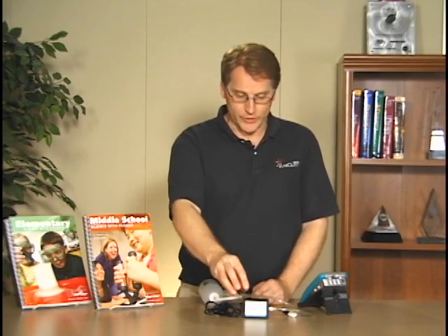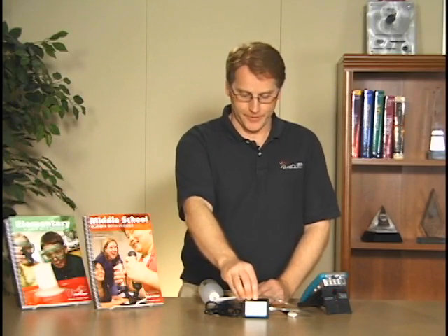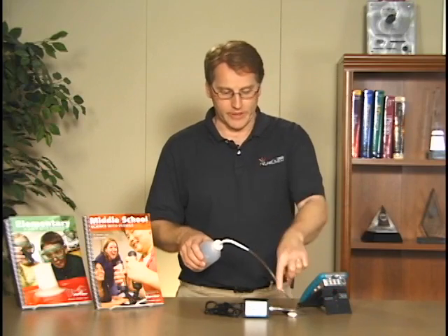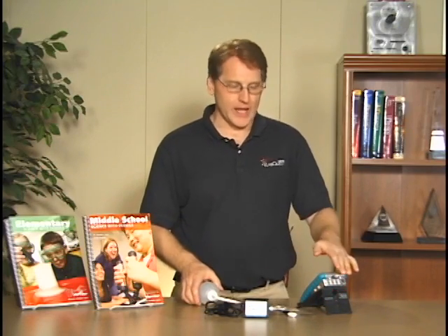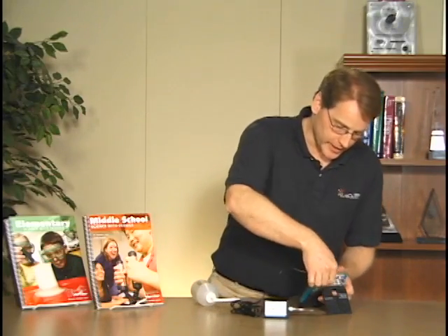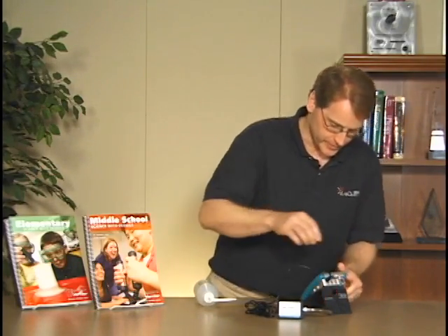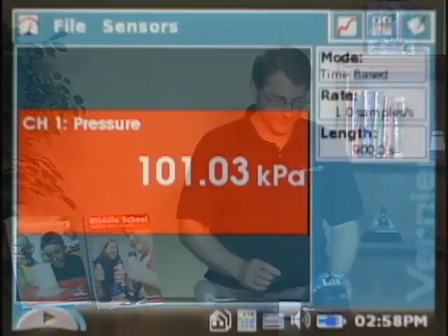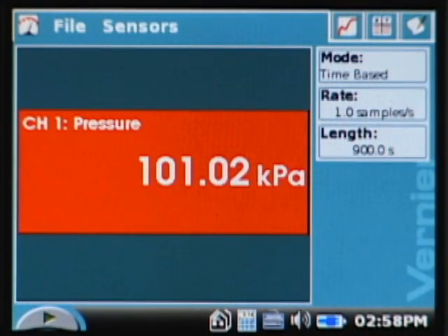For this lab, we are going to use a gas pressure sensor, and we've connected it to a water bottle via the tube that comes with the sensor, and we have our LabQuest unit. I'll start off by just plugging in the sensor to the LabQuest, and the LabQuest detects that it's that sensor.